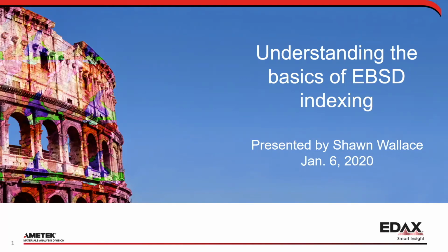I had an older DigiView camera. It goes about 200 patterns per second. It's not very fast, which means you could get really, really good patterns. And when you get those good patterns, you feel good about your data. But as you go faster, your pattern quality tends to get a little bit lower.